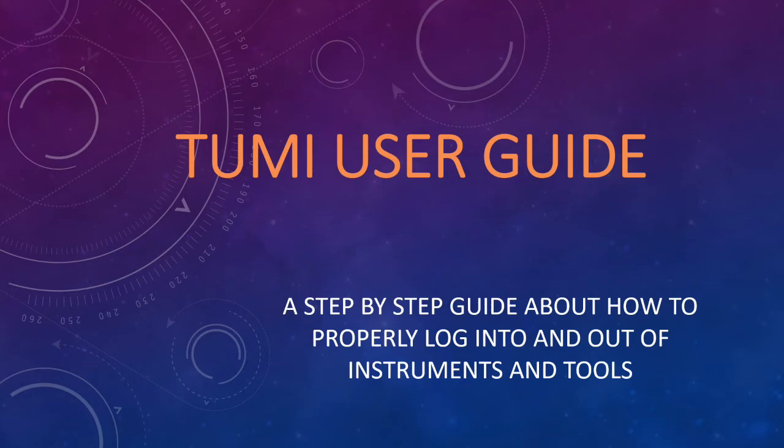Welcome. This presentation is a step-by-step guide to the use of the TUMI system and how to properly log into and out of instruments and tools, as well as handy features to keep you informed as to the status of the tools.